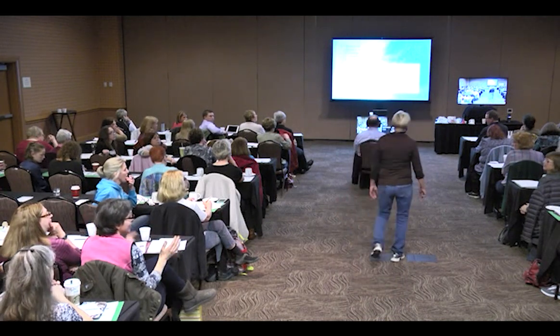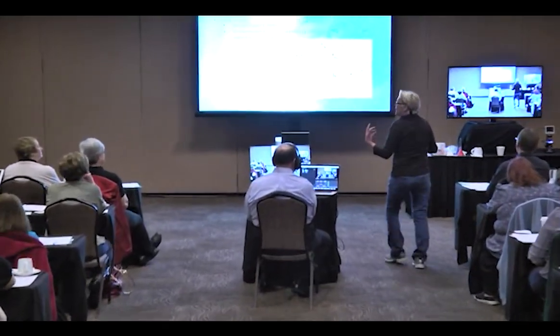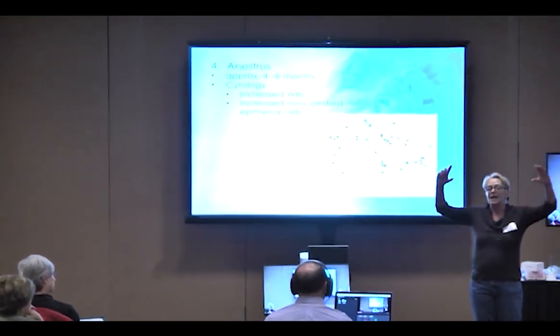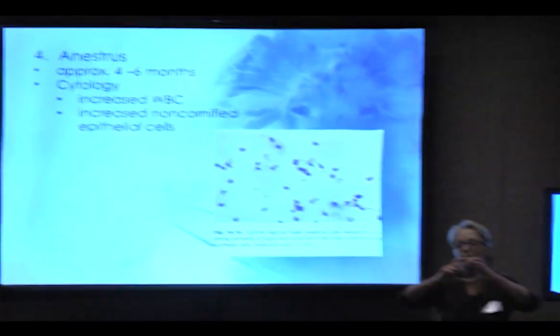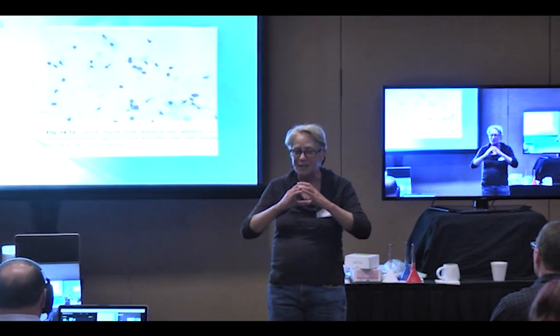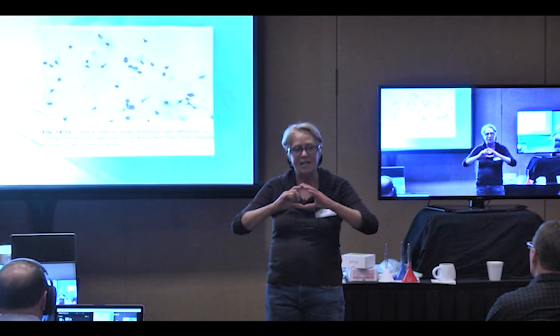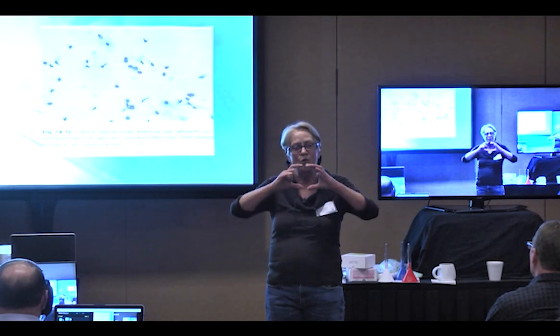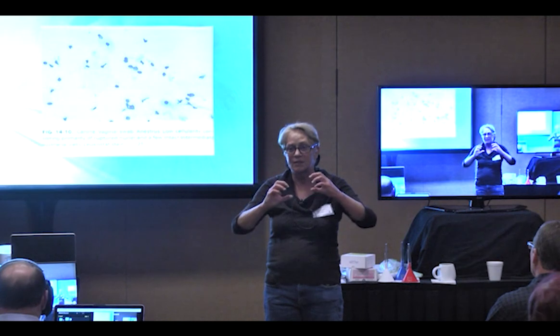Okay. This is all like 6 slides later, but that's okay. Anyway, what I want you guys to know about these things is that in proestrus, which is early, pro means early, the cells are big and round with big and round nuclei and lots of red blood cells. In estrus, they look like tissue paper that's been folded back on itself. That's when you want to breed. In diestrus, which is at the end of their heat cycle, they will convert back to the big round cells with the big round nuclei, but instead of a bunch of red blood cells around, they'll have a bunch of white blood cells around.